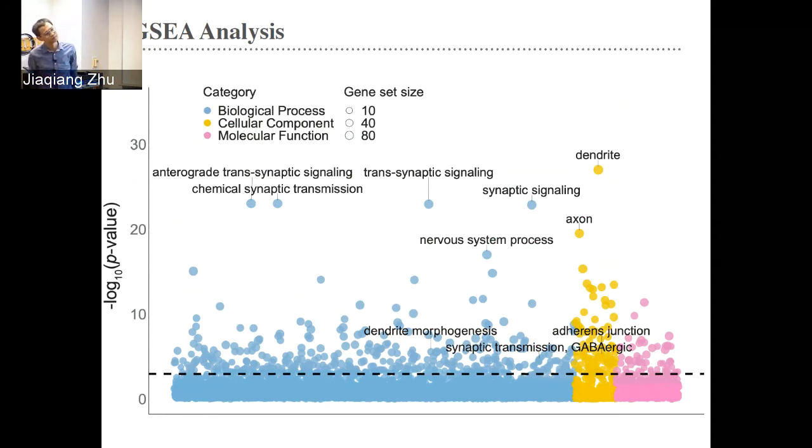So, are you actually running a pipeline from the node? This result is based on the 772 spatial genes we identified. So you actually ran it on the gene list. One immediate question: although your method is more sensitive to low expression level spatial dependence, it still helps to be expressed at all. If you just took all of the genes that are expressed in the olfactory bulb, this is kind of what you might expect to see, right? So the question is, how different is this spatial enrichment from the enrichment of the things that are just well expressed?